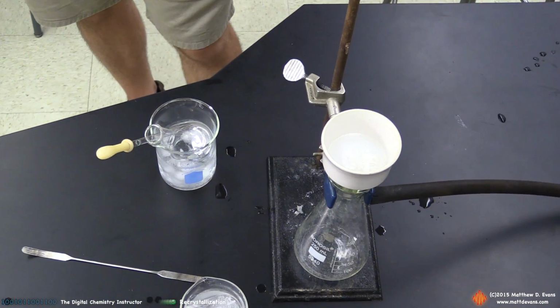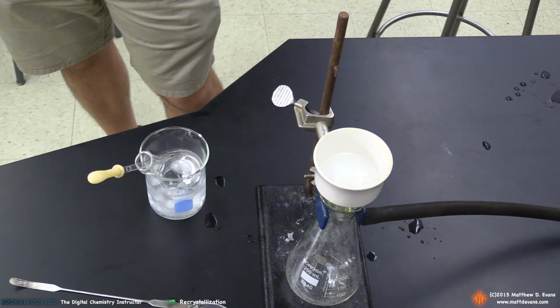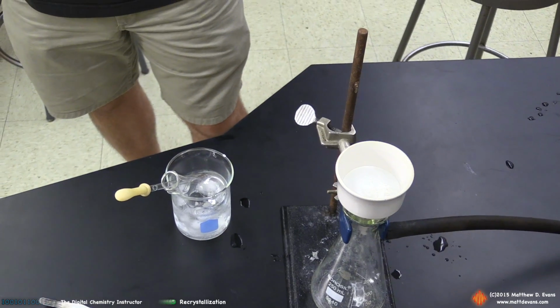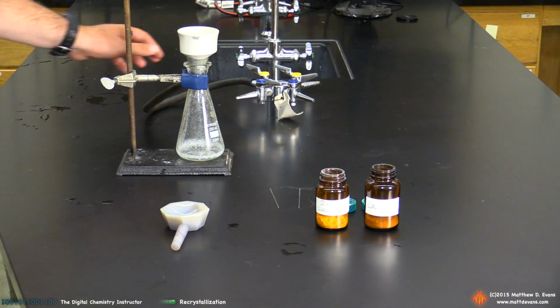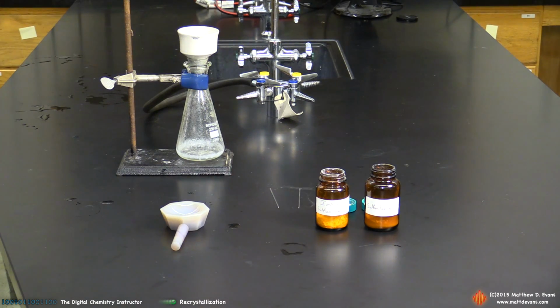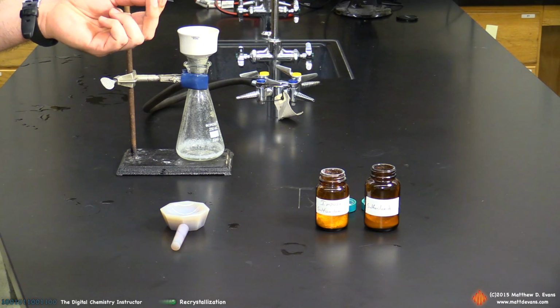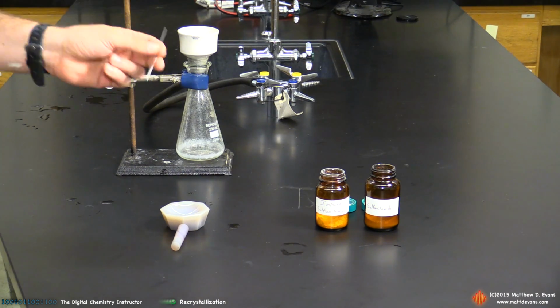Now we're just going to let this sit for about 5-10 minutes, and under vacuum those crystals are going to hopefully air dry, and we'll be ready to measure the melting point temperature of these crystals. We've been letting our crystals dry now for about 10 minutes or so in the Buchner funnel. I'm going to turn off the vacuum. One of the ironies of these crystals is they're so pure that they're going to be hard to get into this capillary tube. These are little tubes that we use for melting point determination, and ultimately we've got to get a little bit of sample in here.